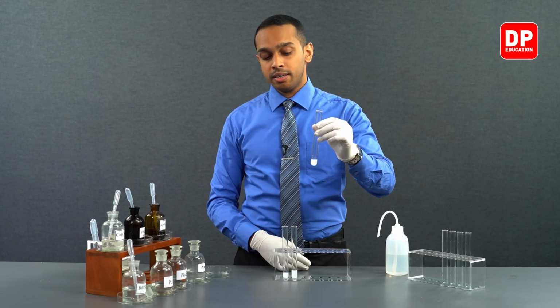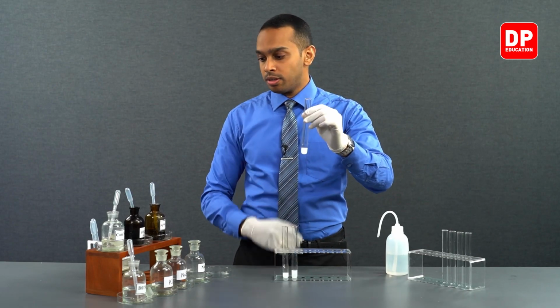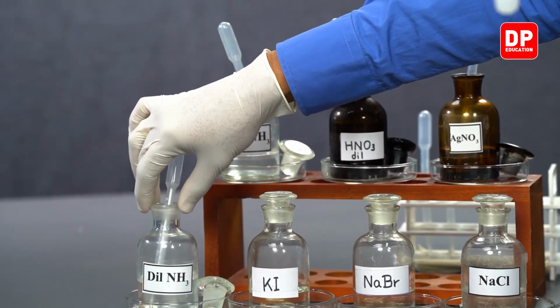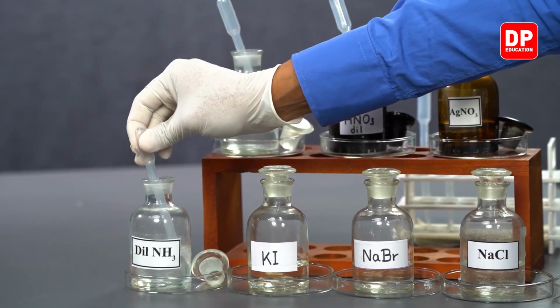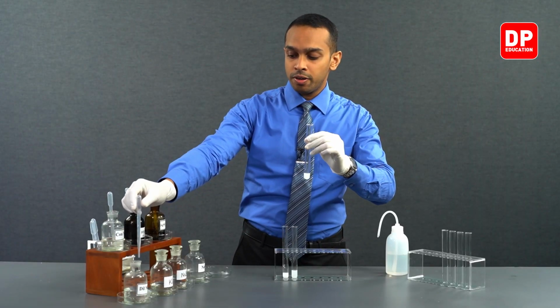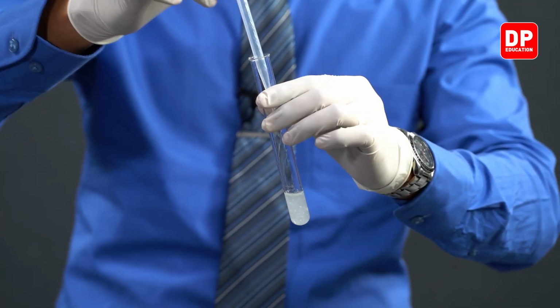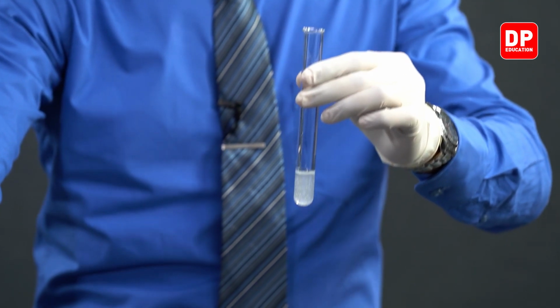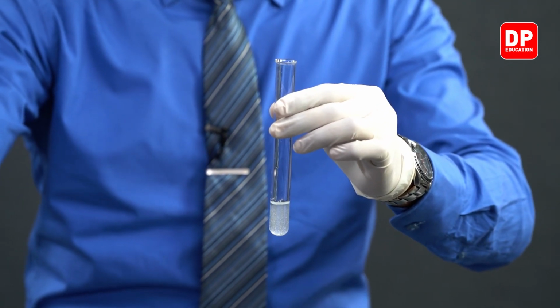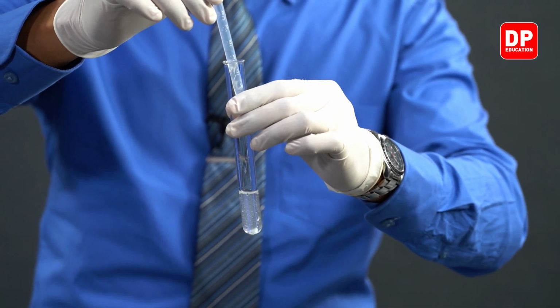Then we will take the remainder of the suspension, where we have silver chloride, and we will add a little bit of dilute ammonia to see if it will be able to dissolve the silver chloride precipitate. As you can see, without even giving it a swirl, the precipitate is starting to dissolve.